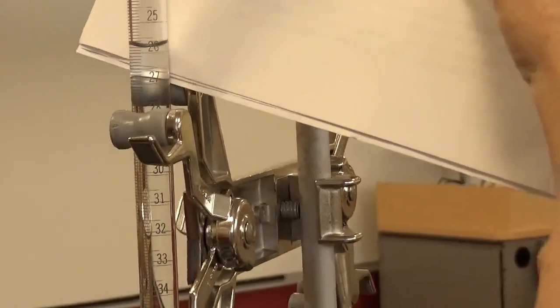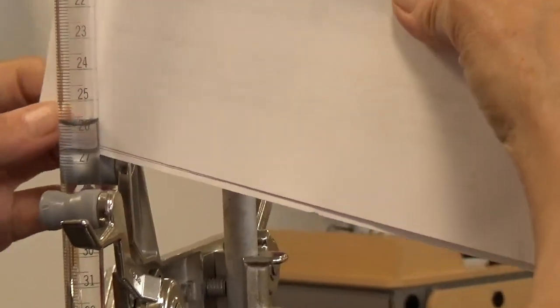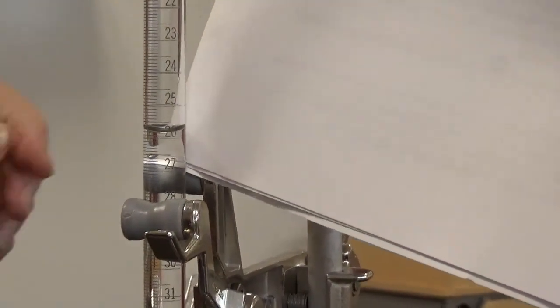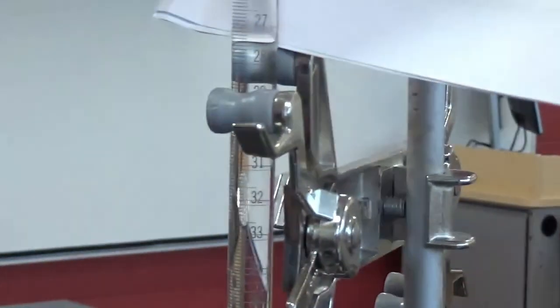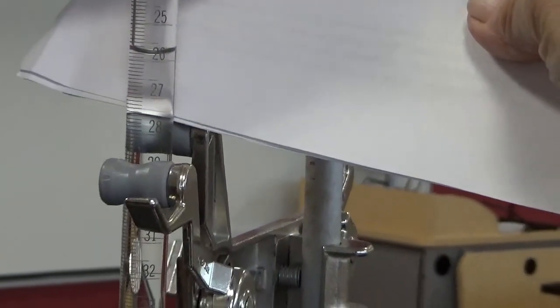Let's see. It's about 25.8, but let me see if I can get, I'd say, you know, I'm going to move this just a little. I'd say it's 25.80.